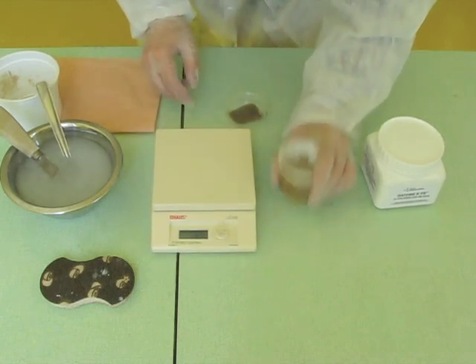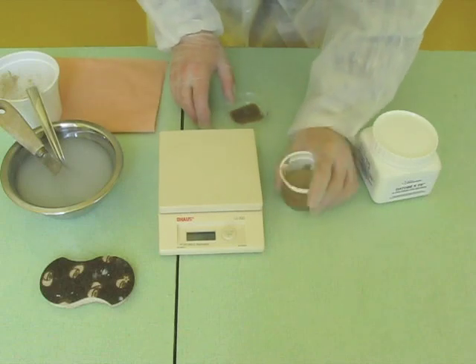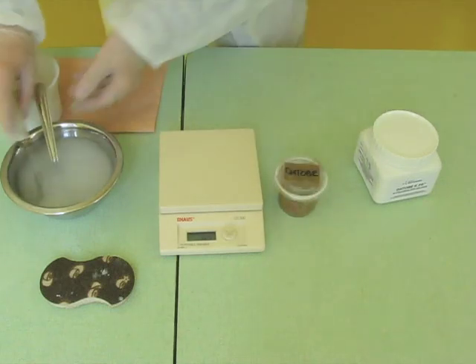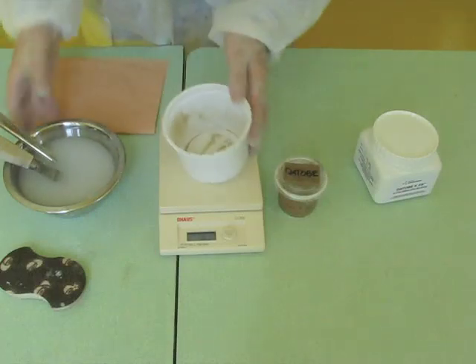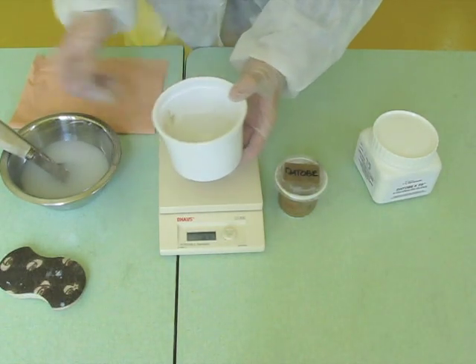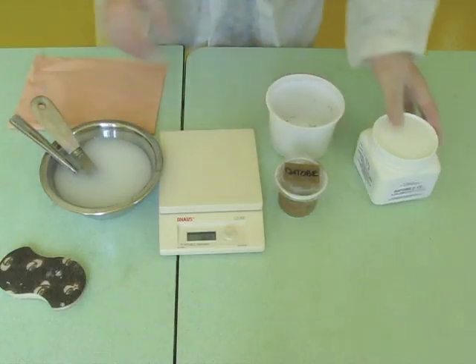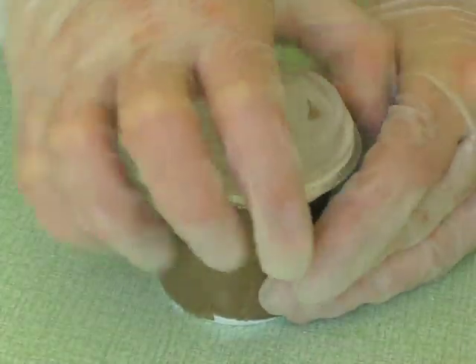Do not hesitate to use vibration to get rid of the bubbles. You can clean the equipment very easily with water as long as the mixture has not yet hardened. After 2 hours at 60 degrees C, note the condensation of water inside the lid.